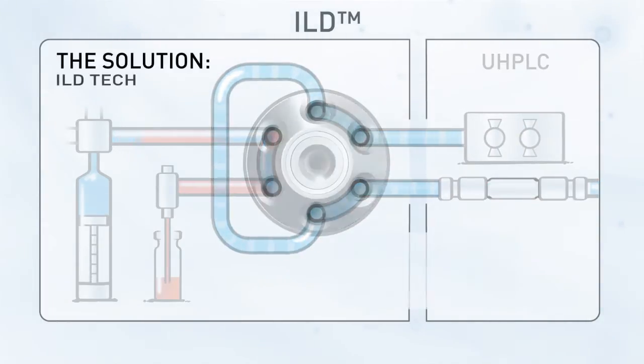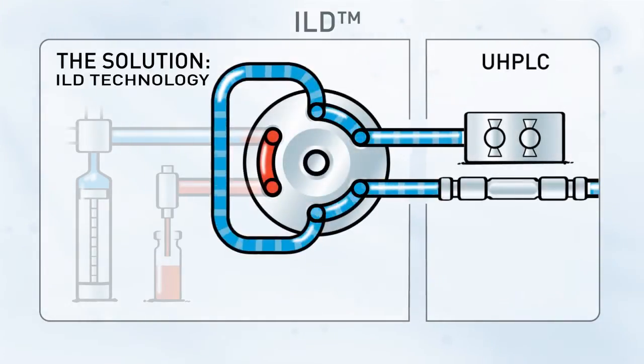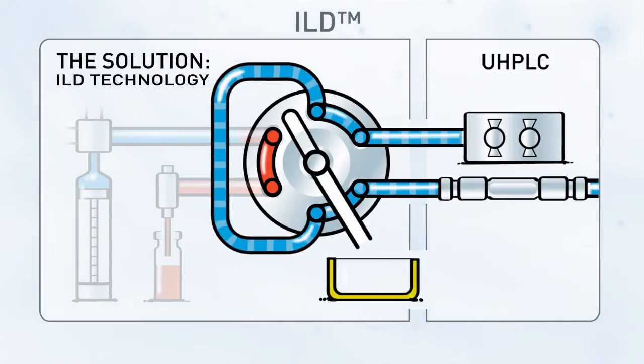The solution. A radial groove in the rotor connected to an additional valve outlet enables decompression of the sample loop before connecting to the sample — intermediate loop decompression.